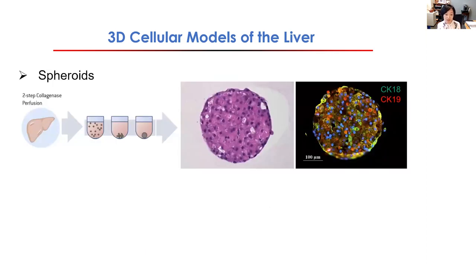So that's where we have the spheroid model, which is also a type of 3D cellular model, but it starts from multi-lineage cells. You just dissociate the liver and get a single cell suspension, and then if you spin down and have the cell aggregate on the bottom, they will grow or organize into this structure called spheroids. And you can see that they also maintain very well these different differentiation markers of hepatocytes.